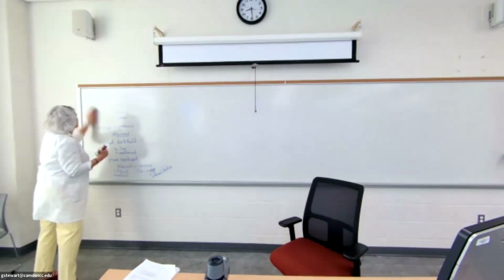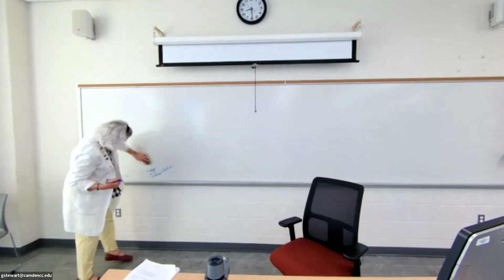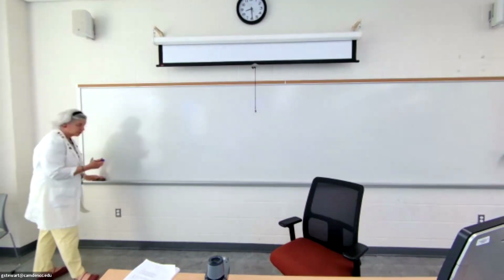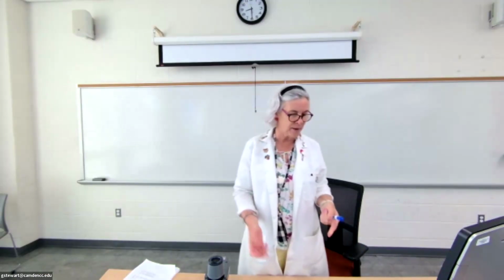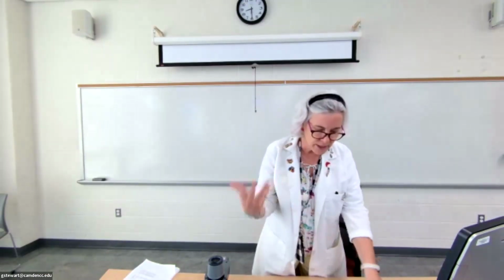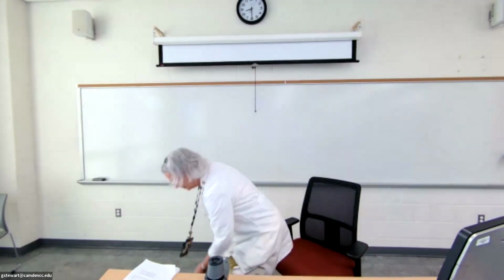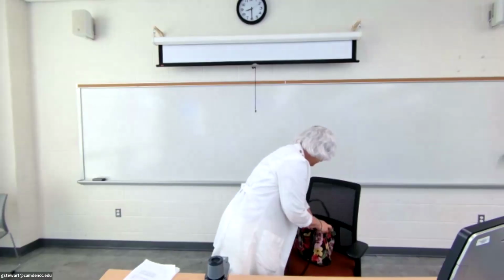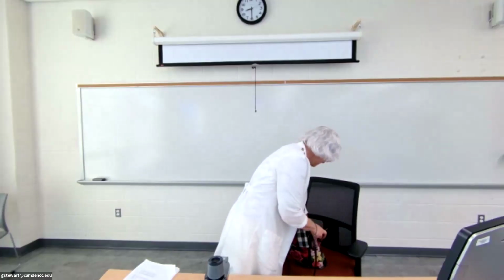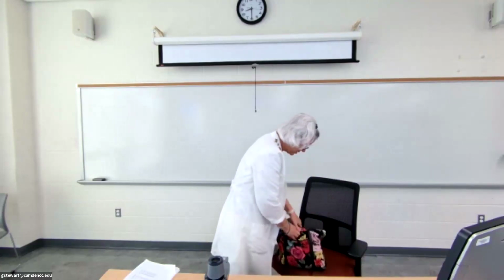All right, so the next section of the chapter, sort of the last section of the chapter, is about making specimens and specimen preparation, which you already know a little bit about because you've done this in lab, right? But it's probably a good idea for us to go over it in very specific detail here as well.